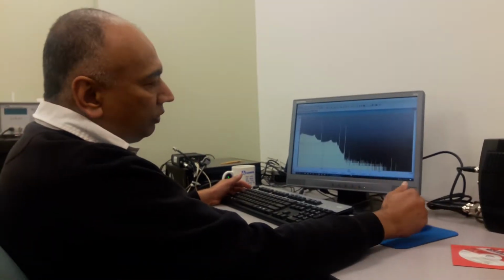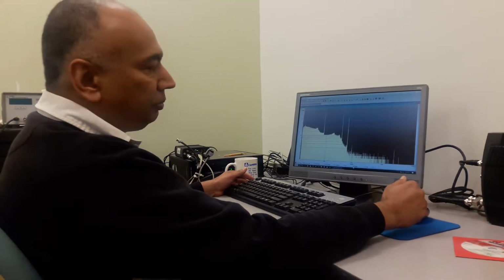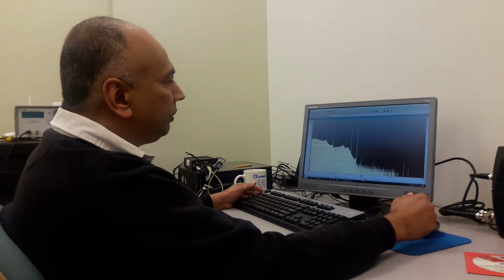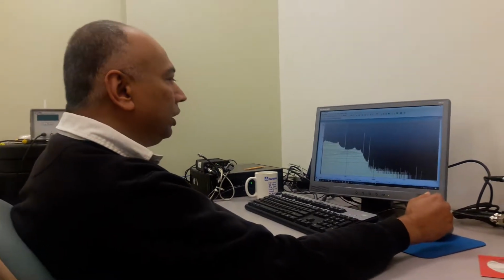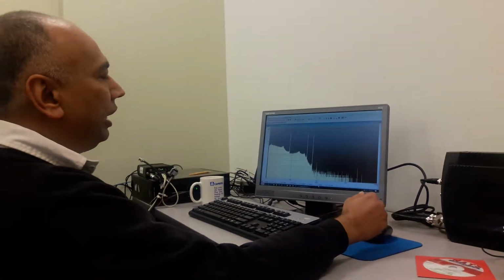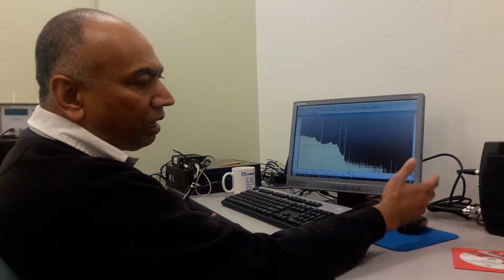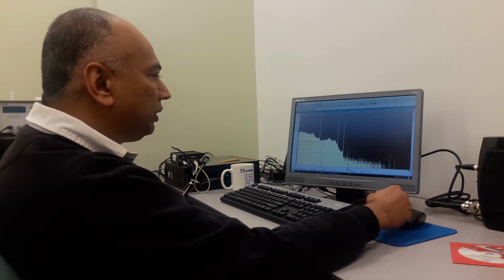Hi, now in this part of the video, in my last segment, we started working with the SpectraLine GP software. We set up all our configuration parameters, and then we initiated a count of a mixed gamma calibration standard source, which had basically cadmium, cesium, cobalt, and then we collected a spectrum for 600 seconds, which is about 10 minutes. Typically, a calibration spectrum should be counted for about half an hour, but because our count rate is sufficient, we counted for about 10 minutes.